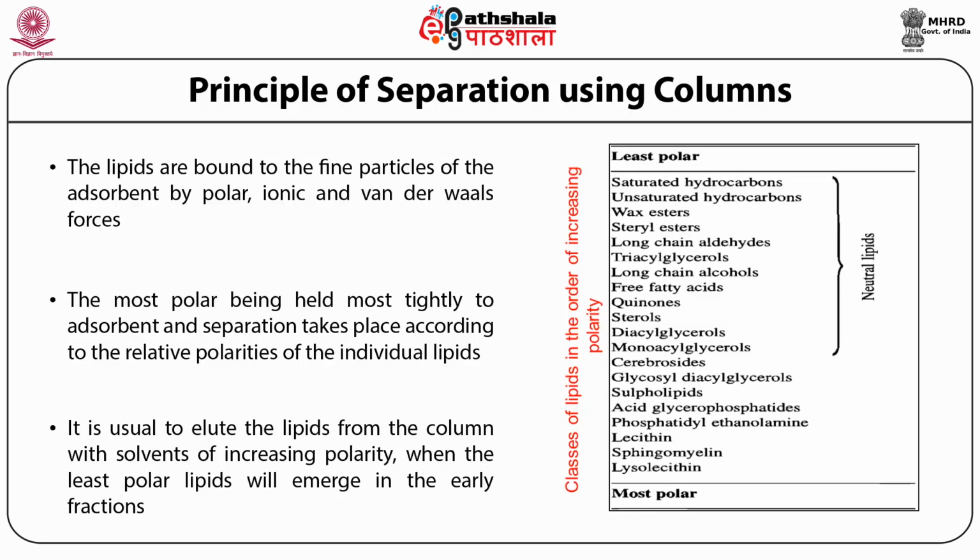Solvents of increasing polarity are used, where the least polar lipid will emerge in the early fraction, while the most polar lipid will emerge in the later fractions.